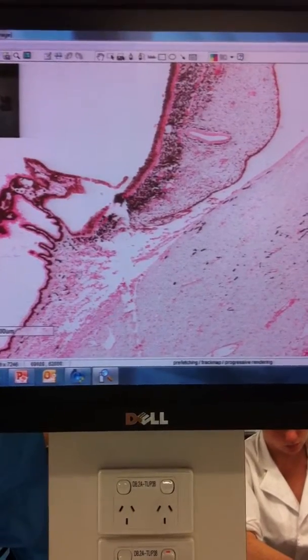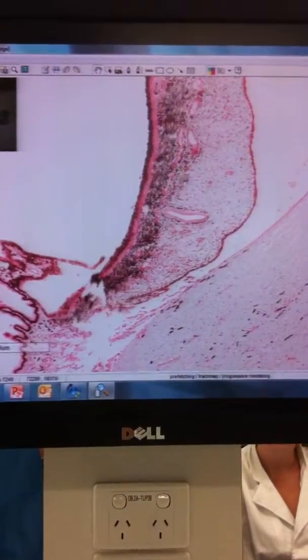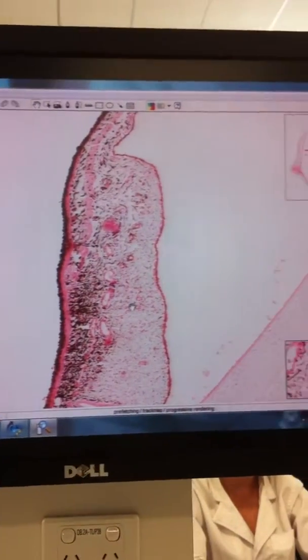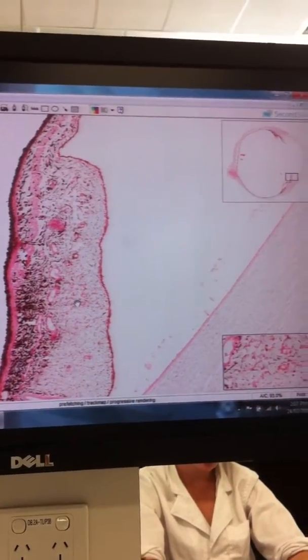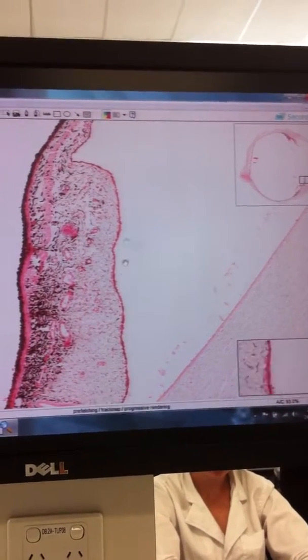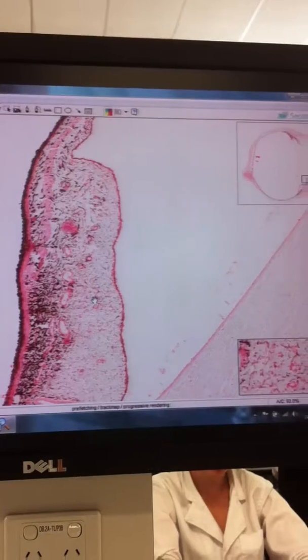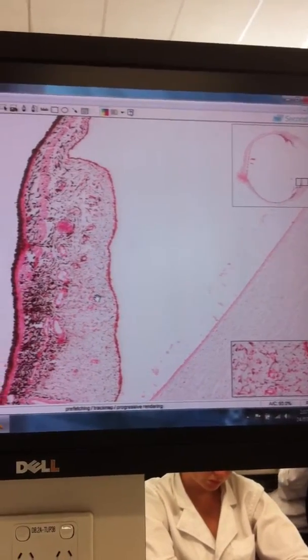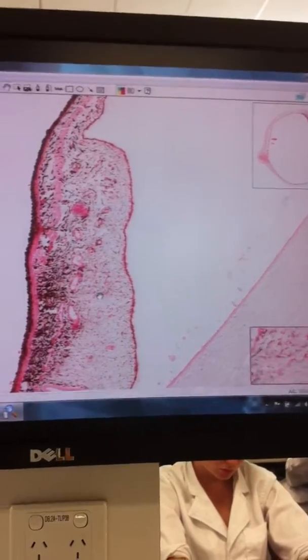So you see all these bits of smooth muscle on here, but then if you're particularly looking along the iris, which is here, remember this is all in 3D, so it goes right the way around. This is a very vascular structure. It's also got a lot of pigment in it. So the more pigment you've got, the more your eye is coloured. The less pigment, the less coloured, to blue. And then no pigment is albino.